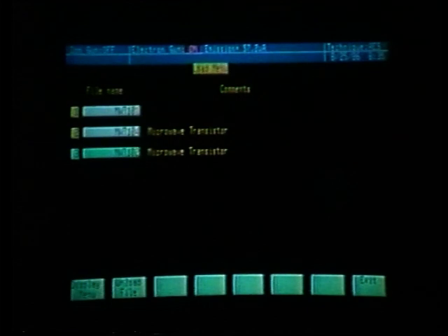What I would like to do is we can superimpose line scans on SEM maps or SEM images and also on Auger maps. So I will leave files MWT101 and MWT104 loaded, and I will load using line number 3 our line scan MWT107. We now want to display that menu, pressing soft key number 1.